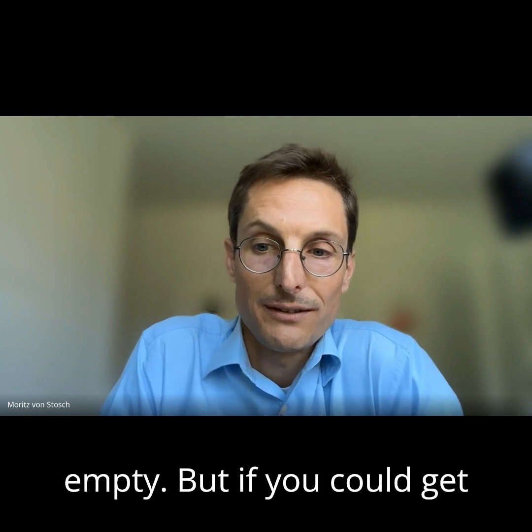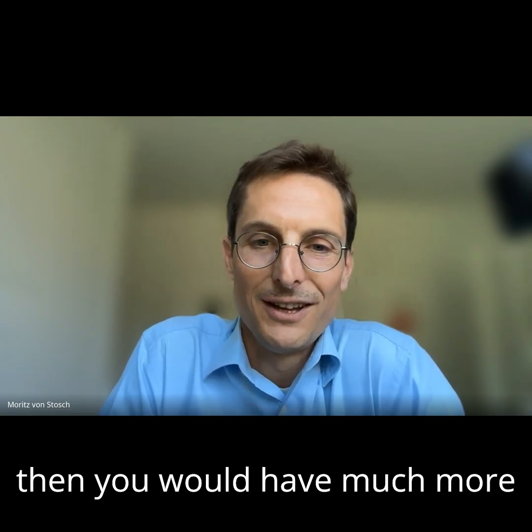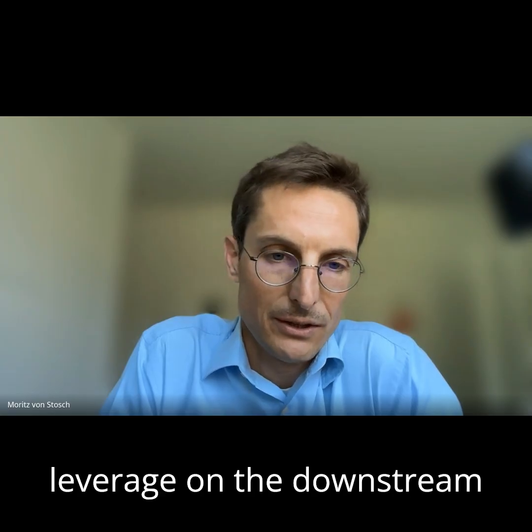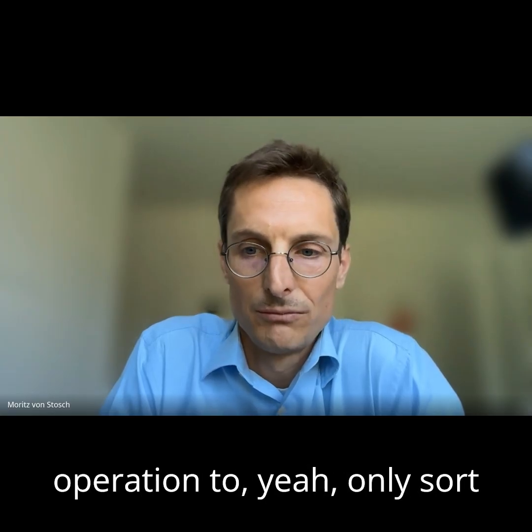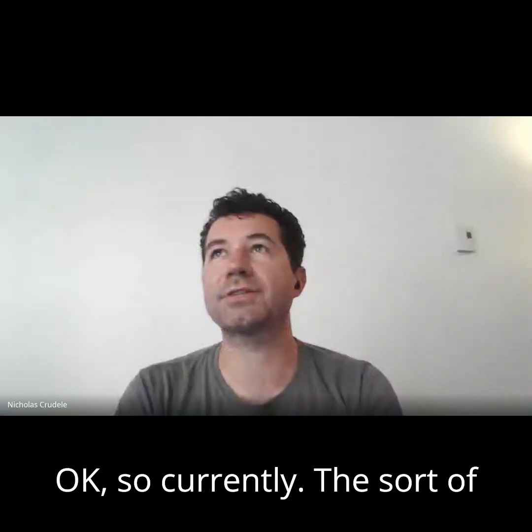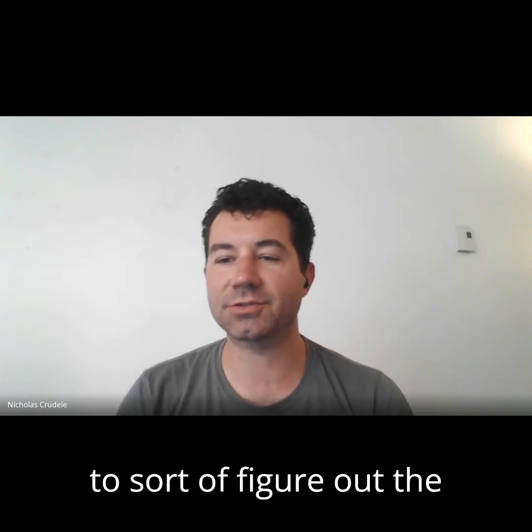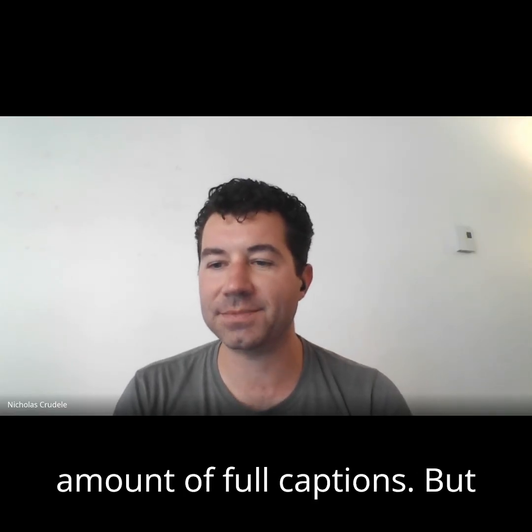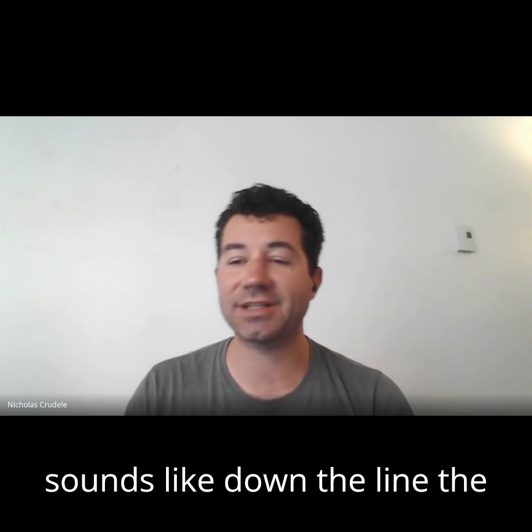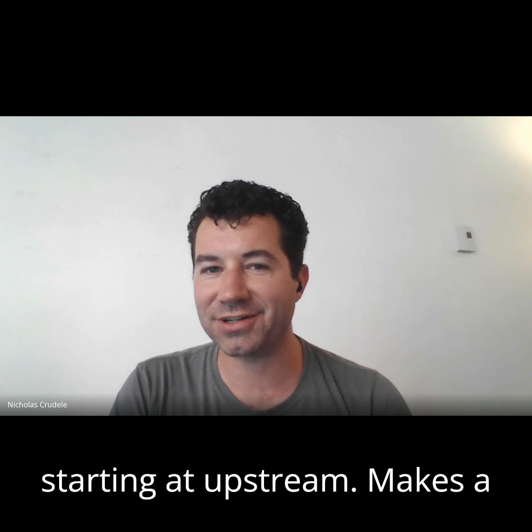So yes, there are ways to do that and to consistently get a certain full to empty ratio. But if you could get it right the first time, if you could get it upstream, then you would have much more leverage on the downstream operation to only sort out a few empty capsids. Okay, so currently the control step is downstream to figure out the amount of full capsids, but down the line the goal is to have the right amount of full capsids starting at upstream. Makes a lot of sense.